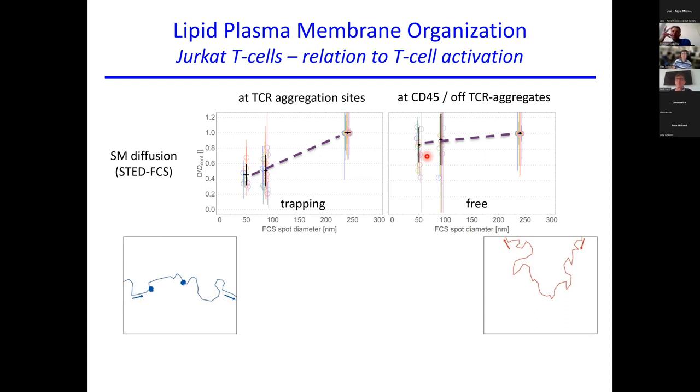And of course, you need very sensitive detection as well, a high NA objective lens, which you use anyway, and a high quantum yield single point detector, single photon counting. Then you can do single molecule based detection of the fluctuations. You can calculate the FCS function. So in principle, you can do this with every microscope. Nowadays, whether you go for all these commercial STED systems, whether you go for Leica, Abberior, PicoQuant, or you go for Urbana-Champaign. What's the company name? Enrico. Yes. They all sell FCS options these days.